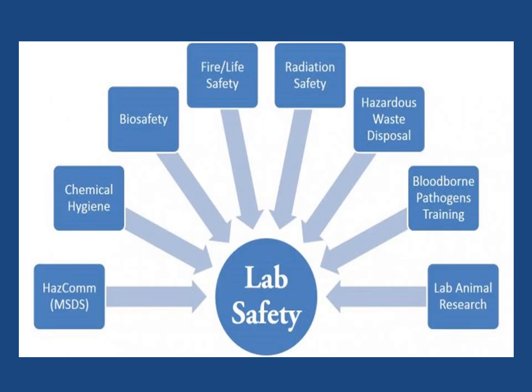This picturizes the various safety issues that must be considered when we talk about laboratory safety. The management of hazardous materials, chemicals, biosafety, fire, radiation safety, hazardous and biomedical waste disposal, handling bloodborne pathogens, and if you're running a laboratory which has animals in it, then you have to talk about the precautions to be taken when handling animals.